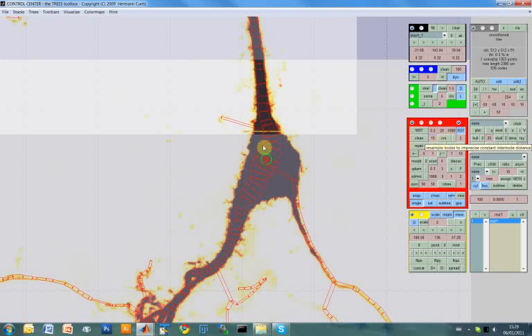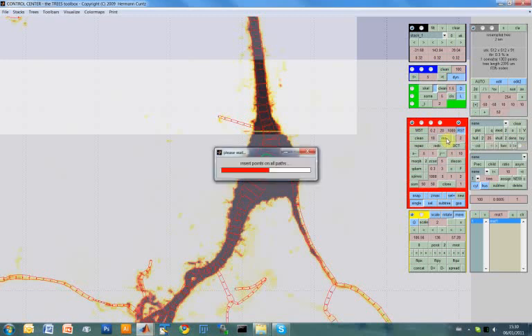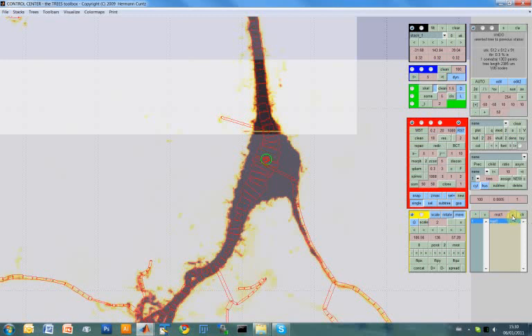That means that all the individual nodes are rearranged on the morphology so that they are equidistant, and in this case about 2 micrometers away from each other. I can press this button, you see now that they're more regularly arranged. So for example this one long piece has become a lot of small pieces, and we can always undo. This is the undo control, or of course Control Z on the keyboard does that as well.